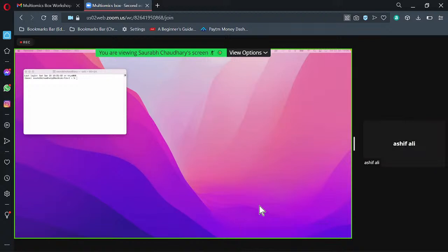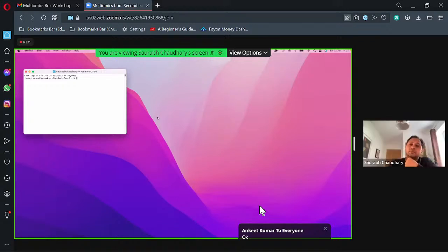Dr. Saurabh, the quality of assembly and other Trimmomatic and other things using Galaxy, when we use them on our own system, do they give the same type of result, or might there be a difference between Galaxy and the command line? Actually, if you are performing using your own command lines, you will have more independence in selecting the parameters.